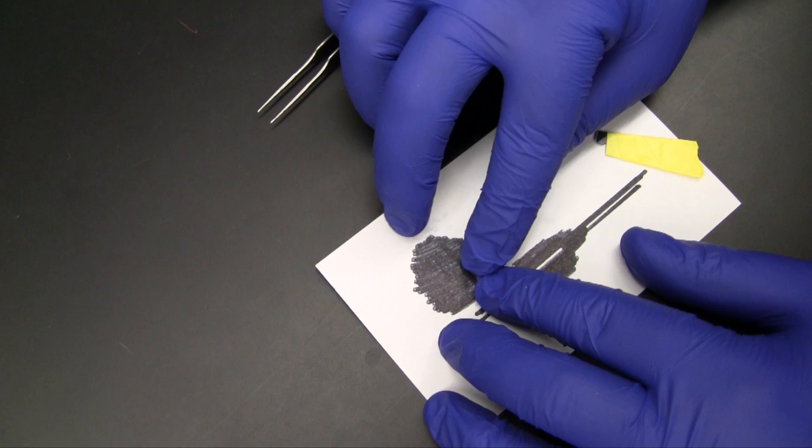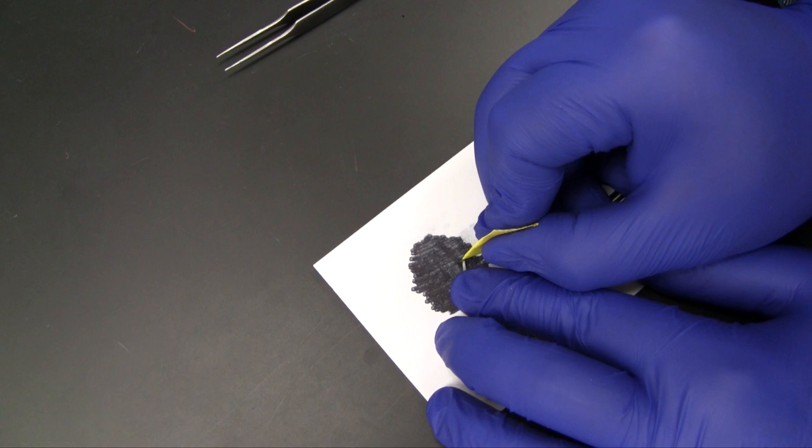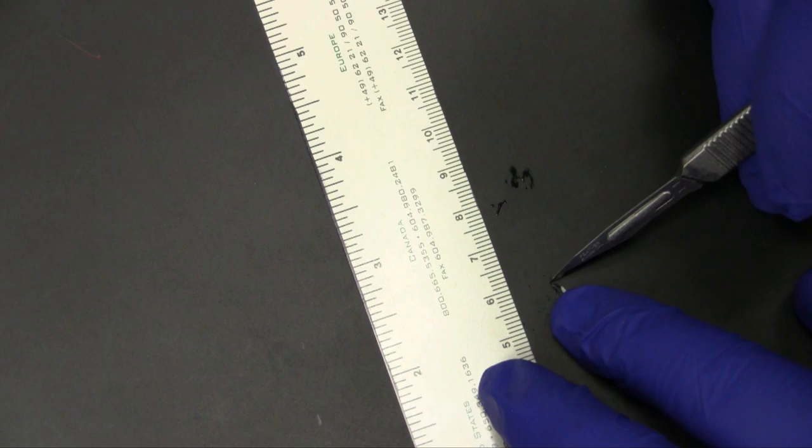To process roots, they are first rubbed towards the distal end to remove the protective viscous layer from the root cap. On most roots, a sharp blade is then used to remove a small section of the root cap, with care taken not to remove the meristem. This increases the surface area exposed to the enzyme. The root cap is left intact on thin roots to prevent overdigestion.